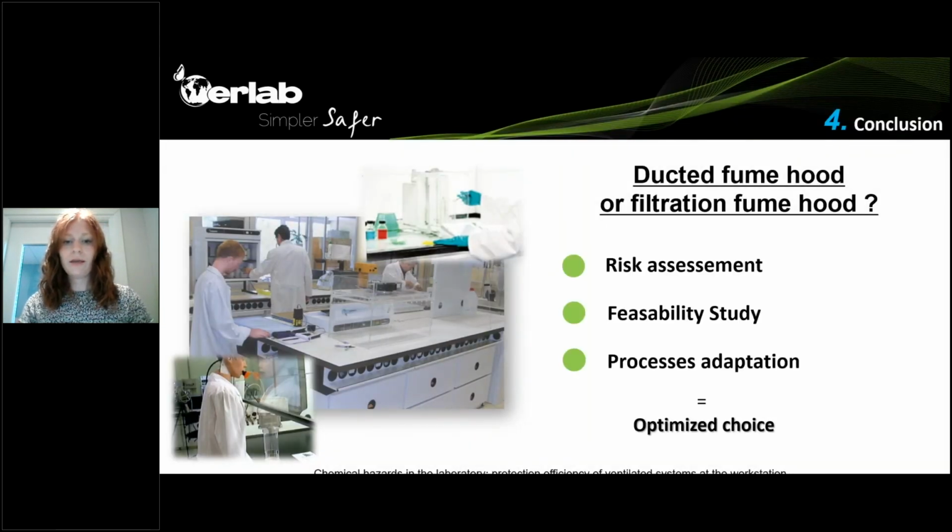In any case, to choose between a ducted or a filtration fume hood, what is important to keep in mind for both solutions is that a risk assessment should always be made, understanding the risks that are present in the laboratory for the laboratory personnel based on the workplace exposure values.